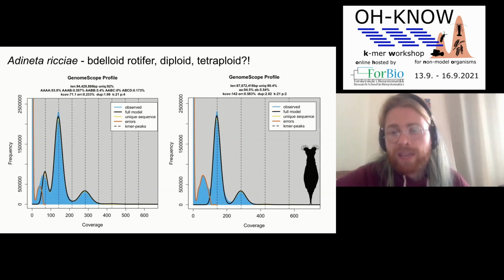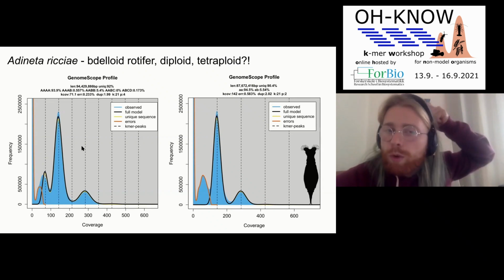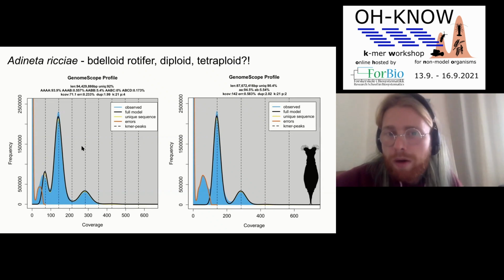So the Kmers take into account the repetitiveness. Basically, if the genomes are extremely repetitive, we're still able to very precisely estimate the size, although people sometimes stop counting after a certain coverage. So no, this is again something we will talk about later. But it could potentially explain part of it if it were the other way around. If you had flow cytometry that says the genomes are big and Kmer spectra that says the genomes are small. But if it's the other way around, it's impossible.